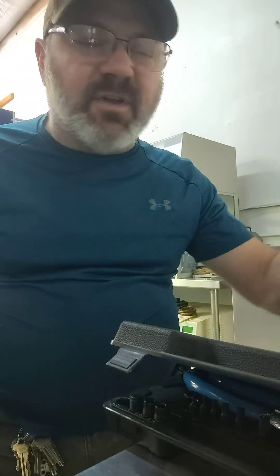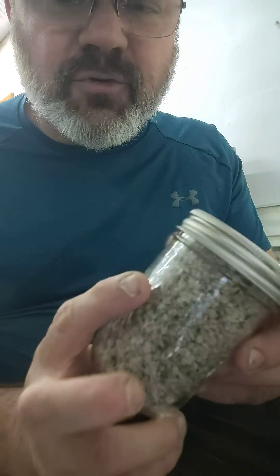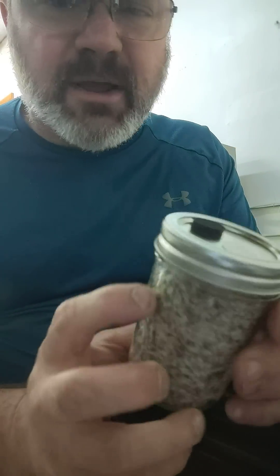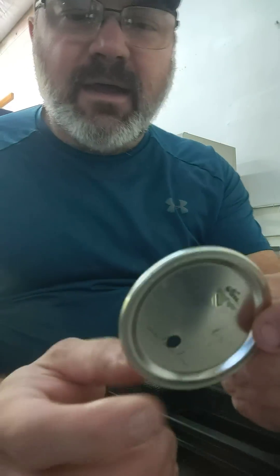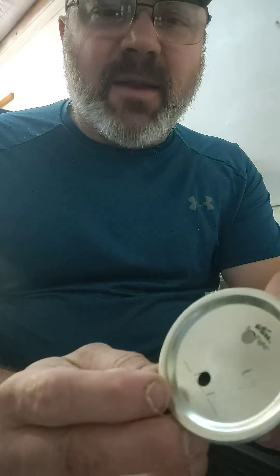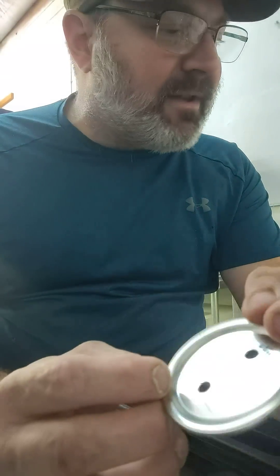Hey there, I'm just working in the lab today making jar culture setups. I wanted to share with you how I make the lid. A lot of people seem to have challenges with trying to drill the thin sheet metal.